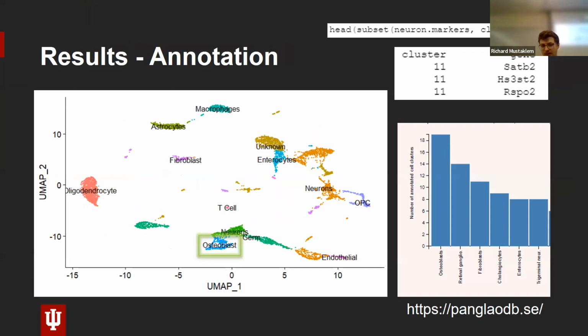What we can tell about this group here is that we seem to have this huge cluster of neurons, but they're very related to these OPC cells. These are oligodendrocyte precursor cells. And maybe we can make some inferences about this. We need to look at our data set and what we're studying. But let's say we're looking into an Alzheimer's data set.